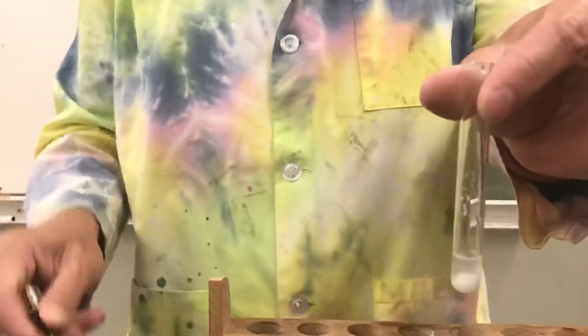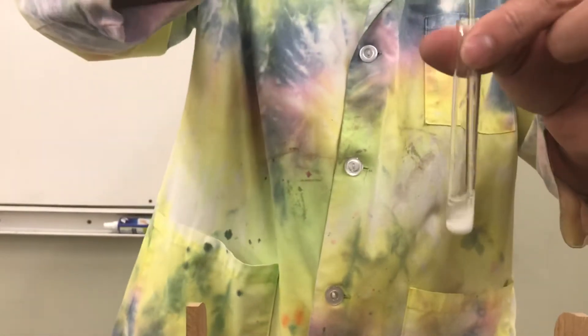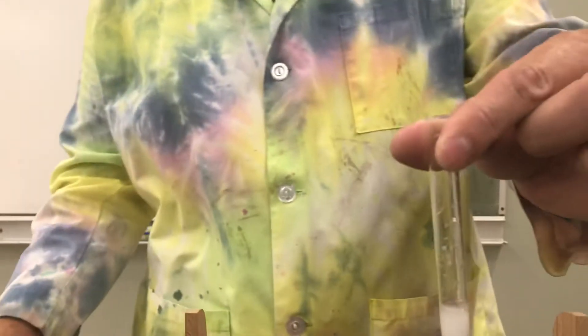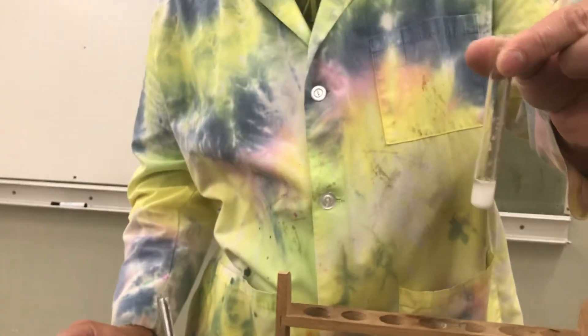And we're going to observe what sort of things we can see. I'm going to take a little stirring rod and mix this around. And you see it gets white and cloudy. And then we just let it settle for a while.